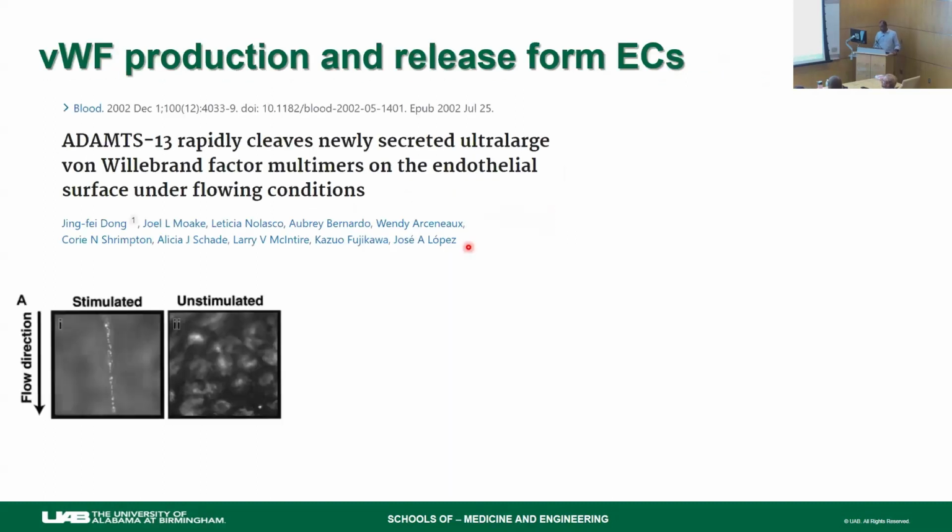Confirmation of that came from reading this paper, where they took endothelial cells, stimulated them with histamine, and then subjected them to flow. If the media that they used for the flow experiments did not have ADAMTS13, it resulted in the formation of these large strings. The way they're visualizing these strings is by platelet binding to those strings. So for the unstimulated ones, there wasn't von Willebrand factor release.